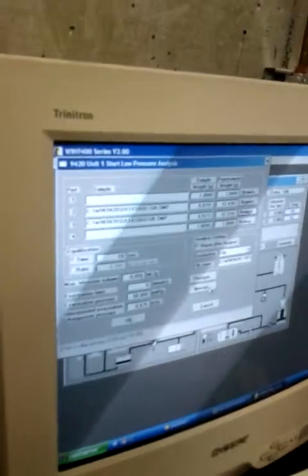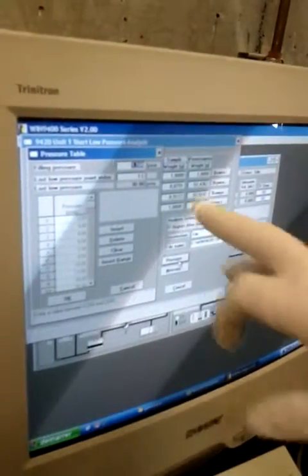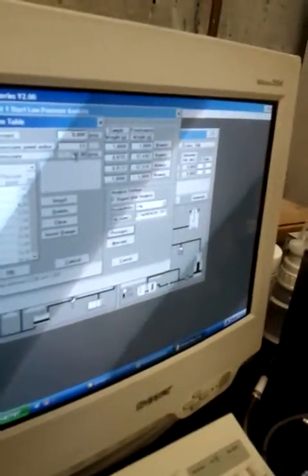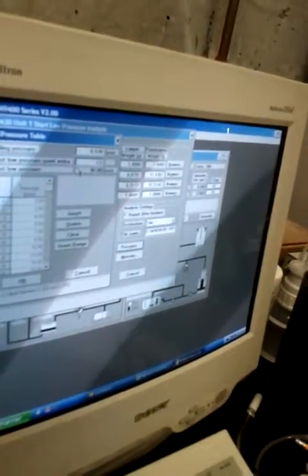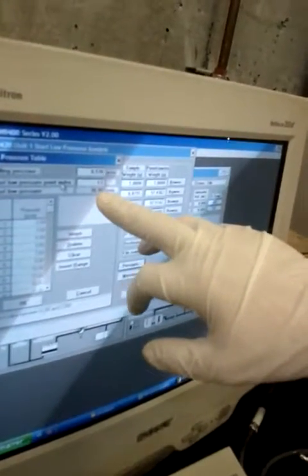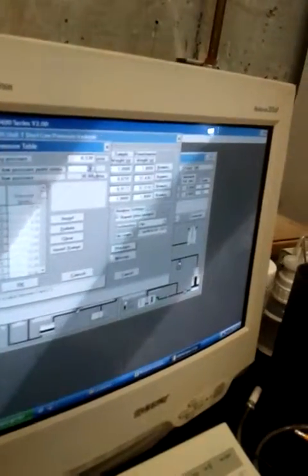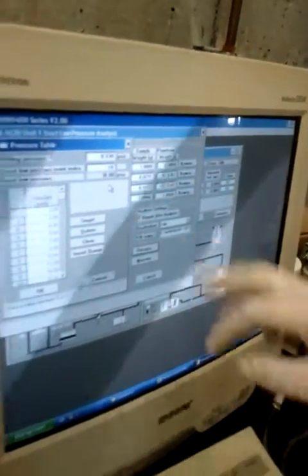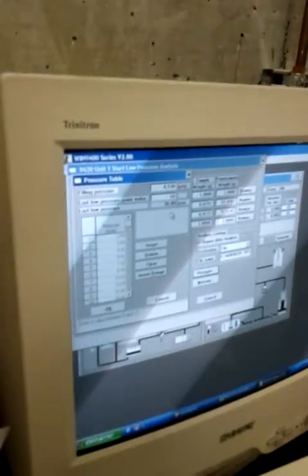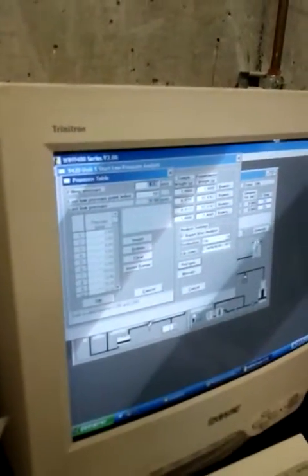After that, we go in pressure, and it's the same thing that we saw on the last one. So here we have to change the firing pressure. It's 0.530, and the last low pressure index. We have to change this too, because there is maybe a problem with the apparatus, but it doesn't work if we do this. So here we only go to the 10, and so it will change this, but it will not be 30 PSIA. The last low pressure will be only 20, but it's okay. And now we click OK, and if we go to pressure, it has changed to the good values.